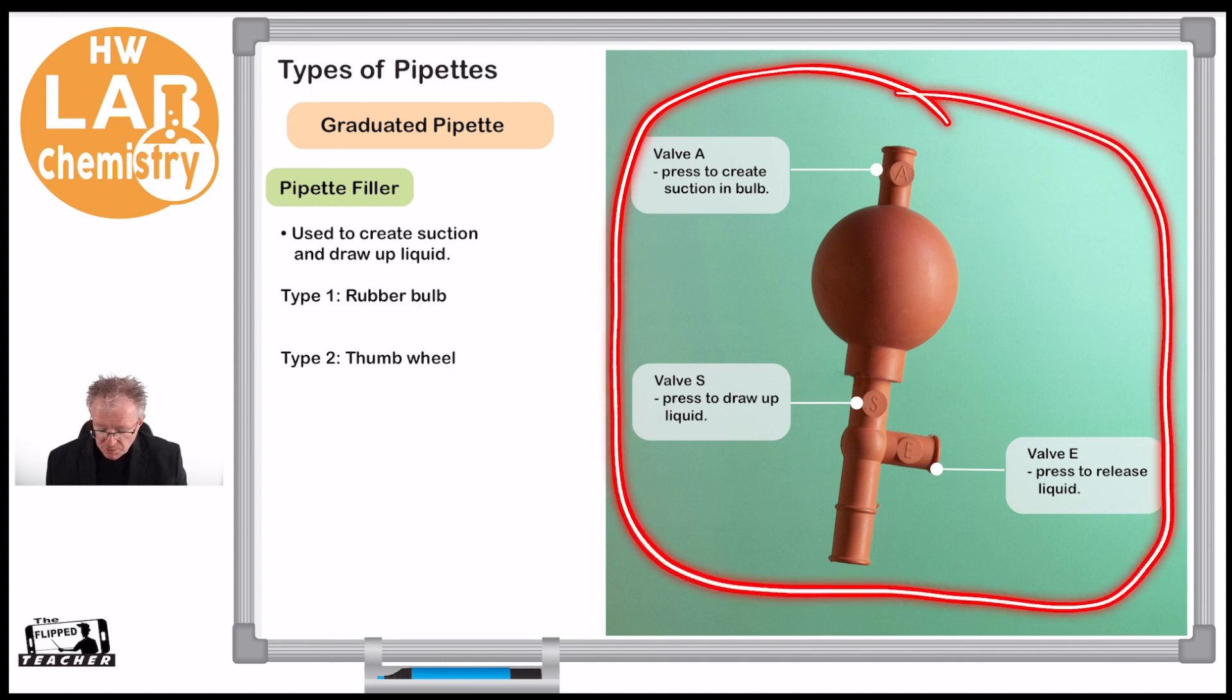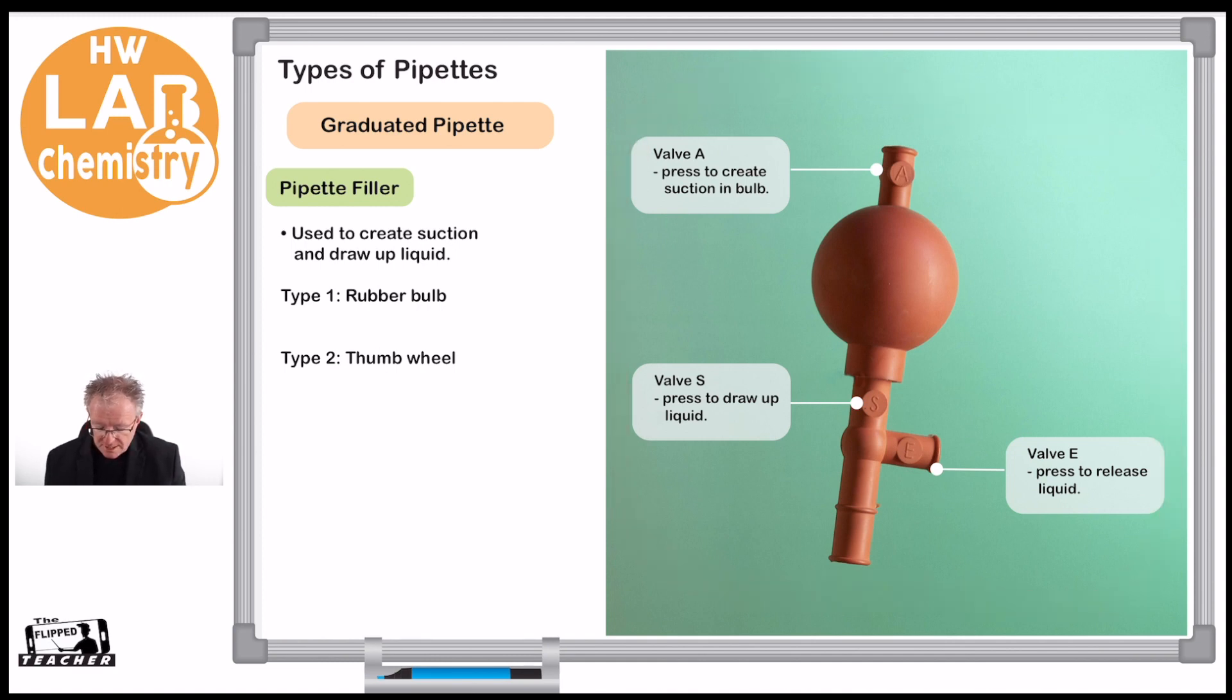Here is our bulb pipette filler. This one, you can see it's got different areas, and let's look at those areas to see how we would use it.